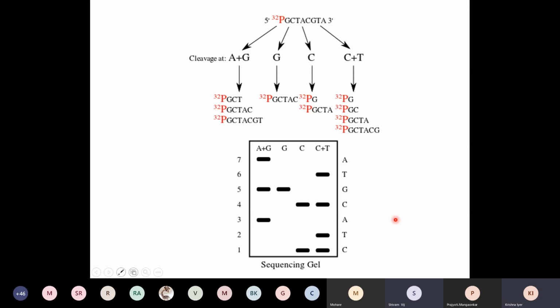No, no, no. What we are saying is the fragment's end has a G, but where did it cut? It cut where there was a C. You see this? Because I treated with hydrazine, and hydrazine modifies cytosine, and hydrazine plus sodium chloride also modifies cytosine. So the piece I'm getting here is a piece which was modified at the C and cut where the C was. And when it was cut where the C was, I was left with what was G. Okay? Are you seeing what I'm saying?